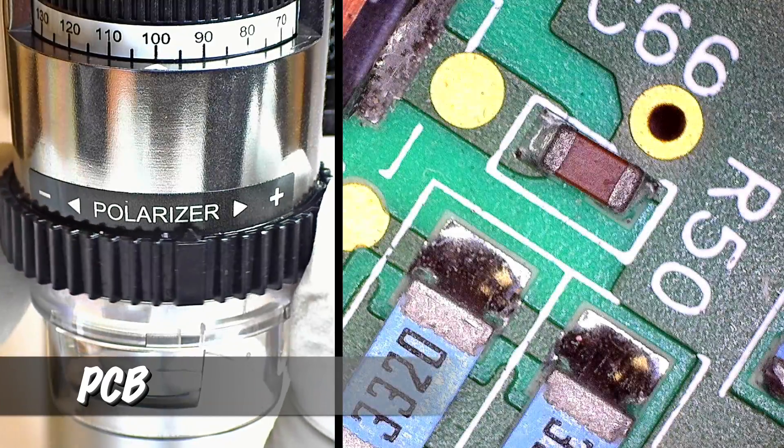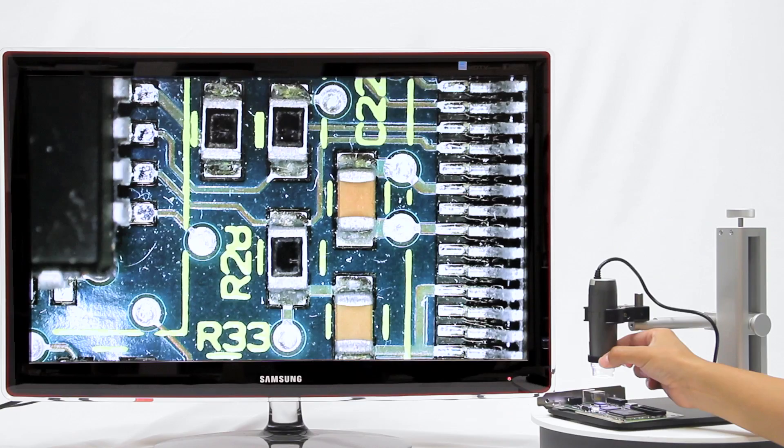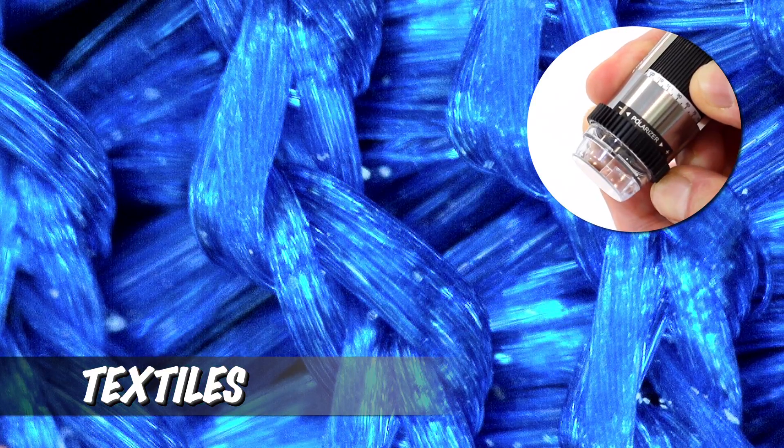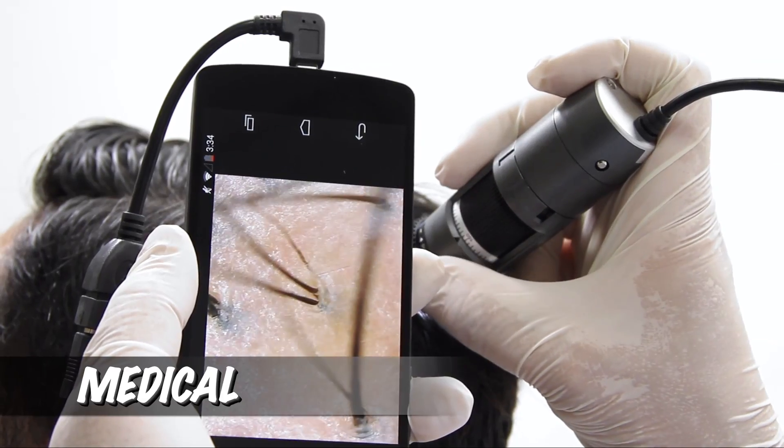These are some examples of the polarizer in use. Some objects may benefit from a partial polarization, while some will look much better fully polarized.